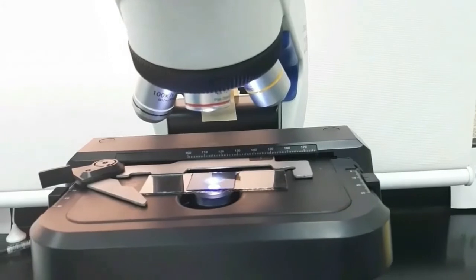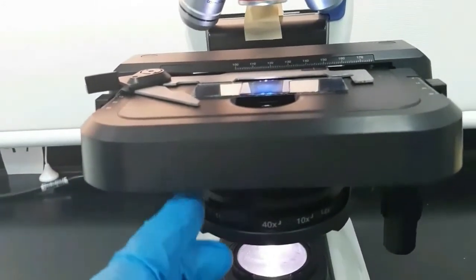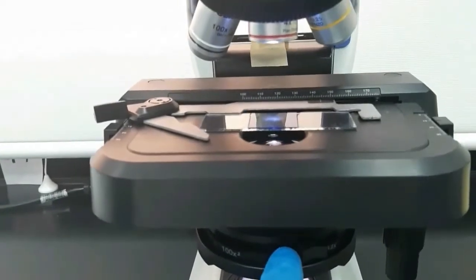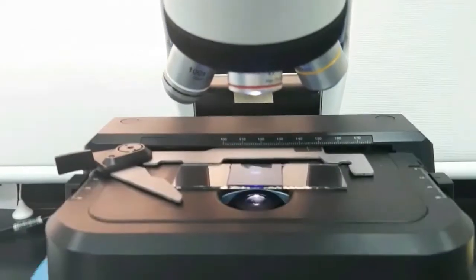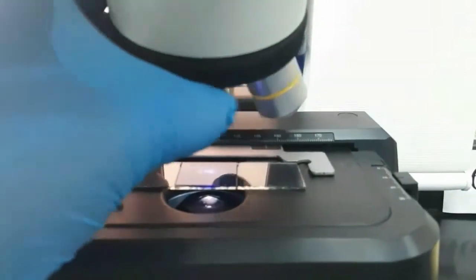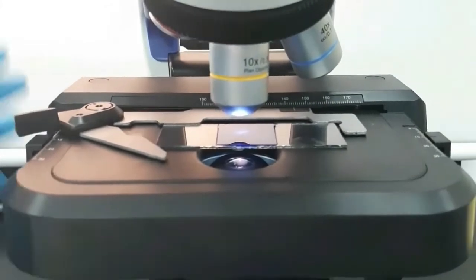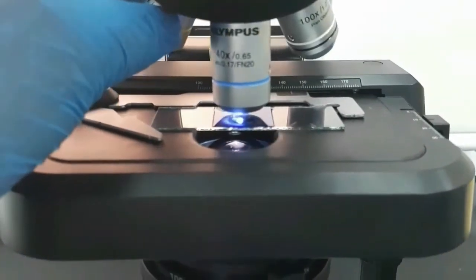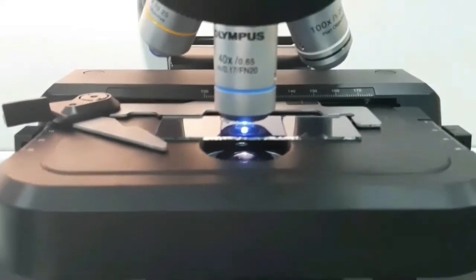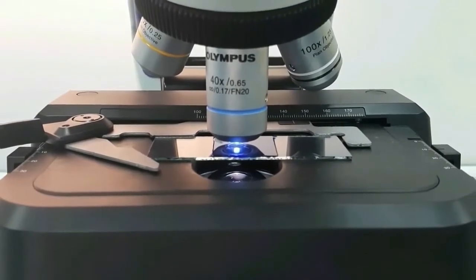Observe the slide under the microscope. First observe in 4x, then 10x, and finally in the 40x objective lens. Under the microscope you can see dark blue colored straight fungal spores and hyphae structures against a pale blue background.